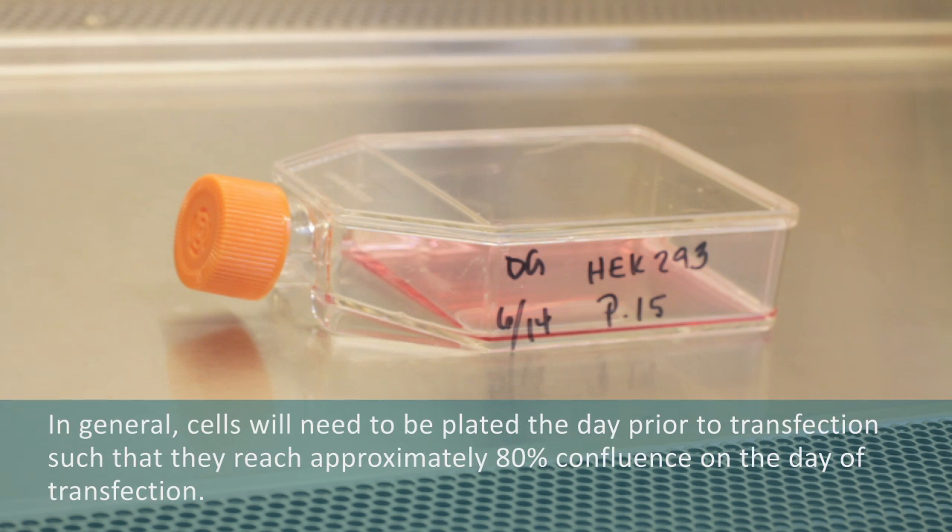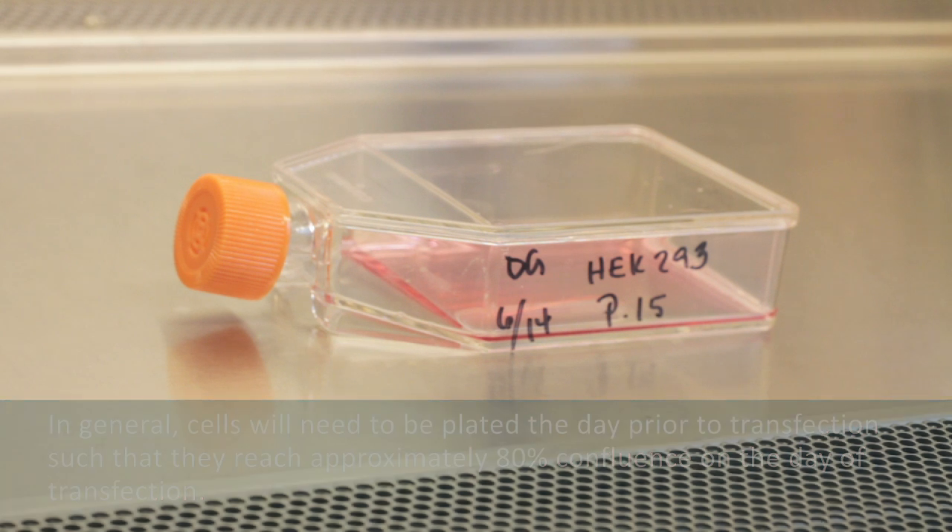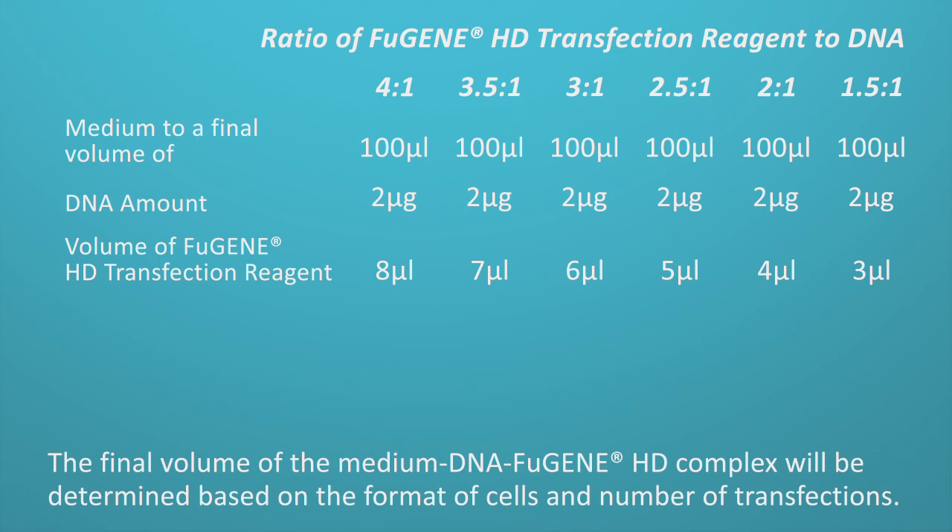In general, cells will need to be plated one day before transfection so that they reach an approximate 80% confluence by the day of transfection. The final volume of the medium, DNA, and Fugene HD mixture is determined based on the type of cells and number of transfections to be performed.